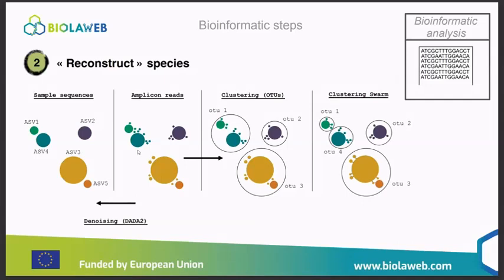So why were you talking about identity? I don't remember. Because you used this term maybe here. It's for the clustering. Yes, it was for the clustering. So when you consider an identity of 99%, it means that 99% of nucleotides must be the same between the two sequences.